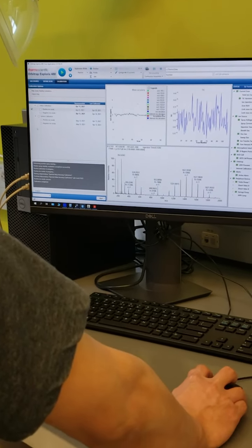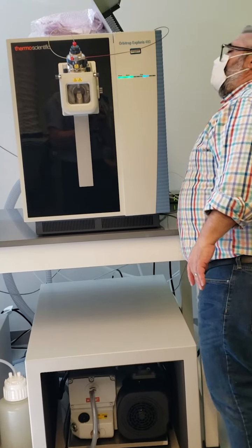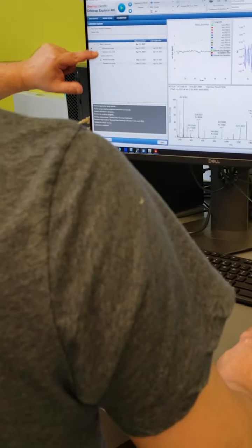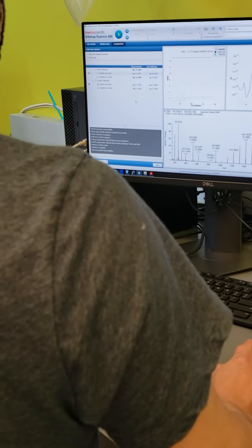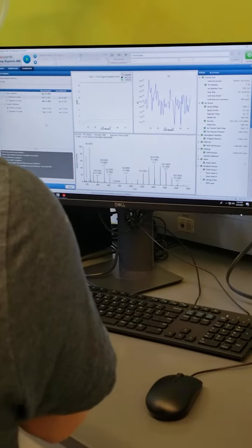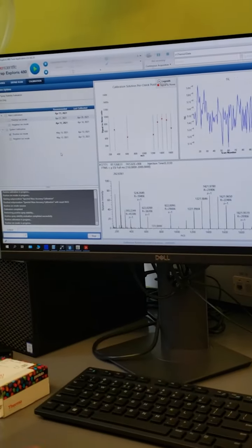Okay. So before we do that, we've got 200 microliters in there. It might make it. It might not. Let's start it because it was just calibrated. So click positive. Never click the negative. Click the positive and hit start. It's going to start off with the system signal stability first, and then it'll go right into it. Now it's going to go through a lot of functionality. This could take about half an hour.